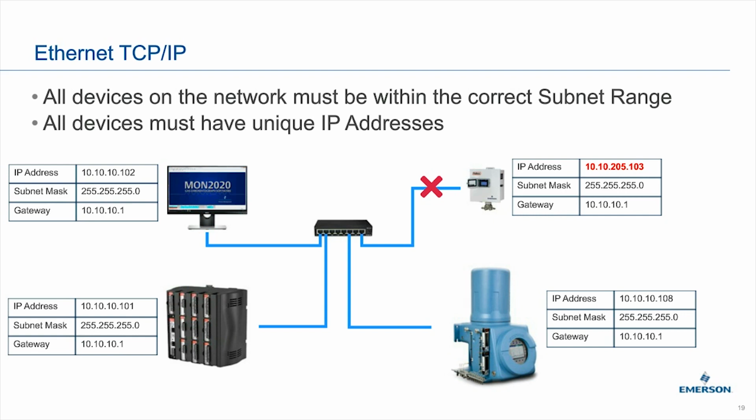Do we have any other options if we cannot use a 502 port? Actually, no. Modbus, although I'm hesitant to use the terminology standard, but the protocol for using Ethernet Modbus is to always use port 502, and the GCs don't have the option of changing that port at this moment.